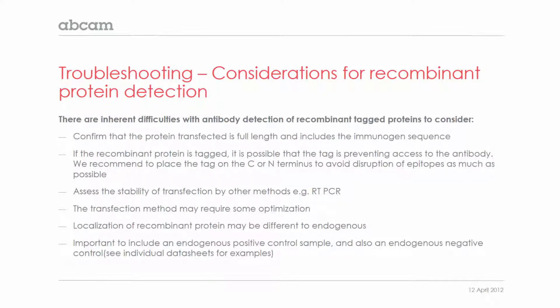The last troubleshooting consideration is recombinant protein detection. Many customers are detecting recombinant proteins, and there are inherent difficulties worth considering before you start. Confirm that the protein you've transfected is full length and includes the immunogen sequence — if you're unsure, contact our scientific support team at technical@abcam.com. Many recombinant proteins are tagged, and sometimes a tag can prevent antibody access to the epitope, so we recommend placing a tag on the C- or N-terminus to avoid disruption of epitopes as much as possible.